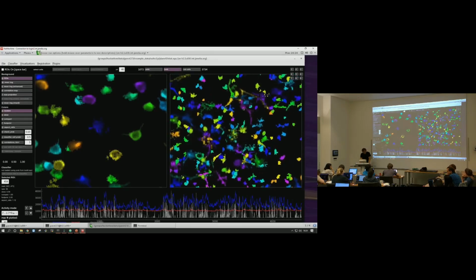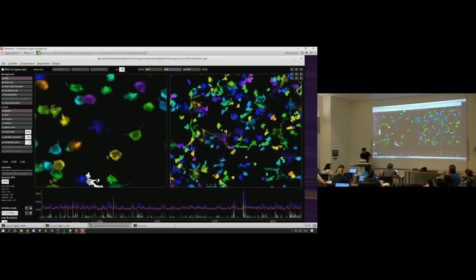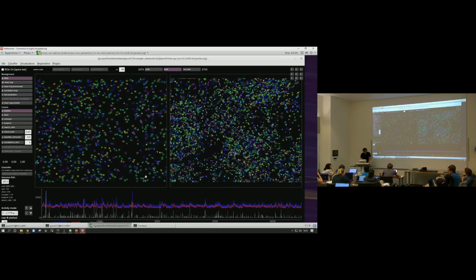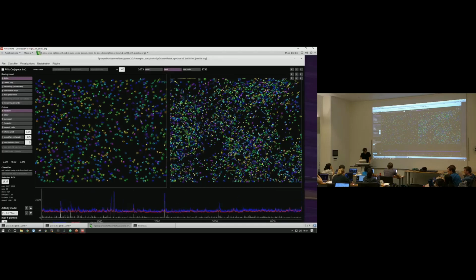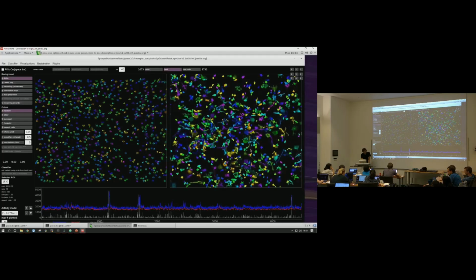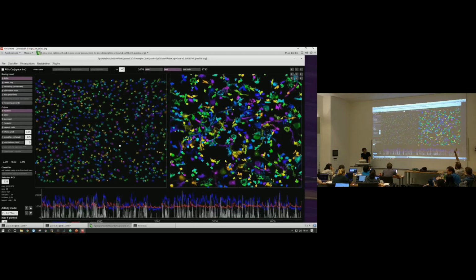Now, this is a really small cell body, but I can recognize it. It gets harder, right? What I recommend doing is, well, you could do two things. You could move through the ROIs one after the other by just pressing the right key, and that will just go through all of them. But that's probably not the most efficient way to do that. The most efficient way is, again, to use your visual system, the very high-tech technology that you have in your brain, and pick out a lot of things. Just scan it, and you'll get a pretty good sense of what's a cell and what isn't.